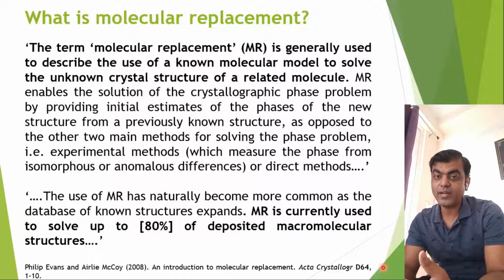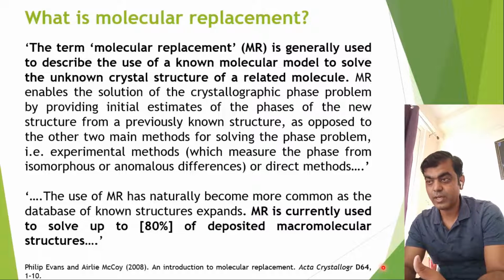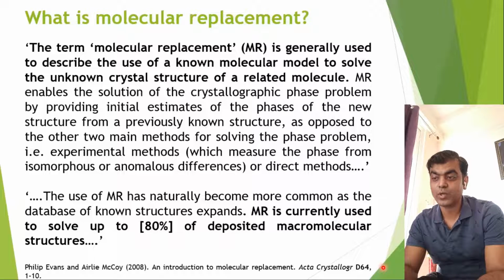So two things: a known molecular model, which you have already understood, at least partially, and that you are using to solve the unknown crystal structure of a related molecule. It has to be a related molecule with which you are trying to solve the structure. Now molecular replacement enables the solution of the crystallographic phase problem by providing initial estimates of the phases of the new structure from a previously known structure. That's what I was telling.